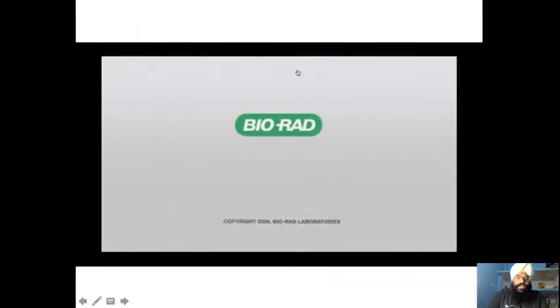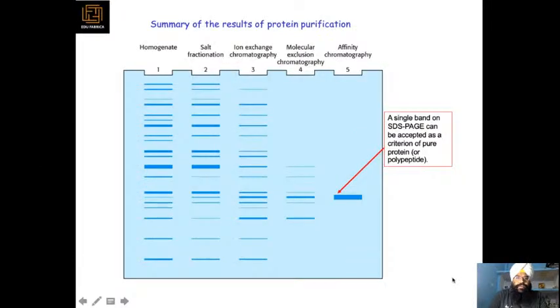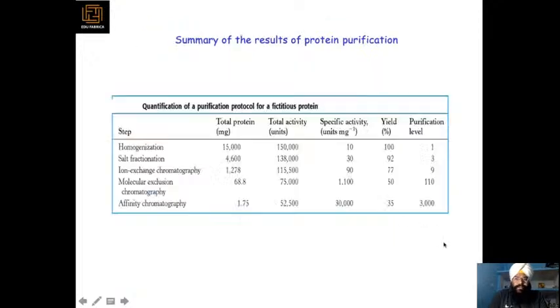So go through these reactions again one more time. This is the summary of the results of protein purification. You have homogenates of all samples, and you do the salt fractionation, ion exchange chromatography, molecular exclusion chromatography, and affinity chromatography. A single band on SDS-PAGE can be accepted as a criterion of a pure protein or polypeptide. And this way you can separate between all your samples.